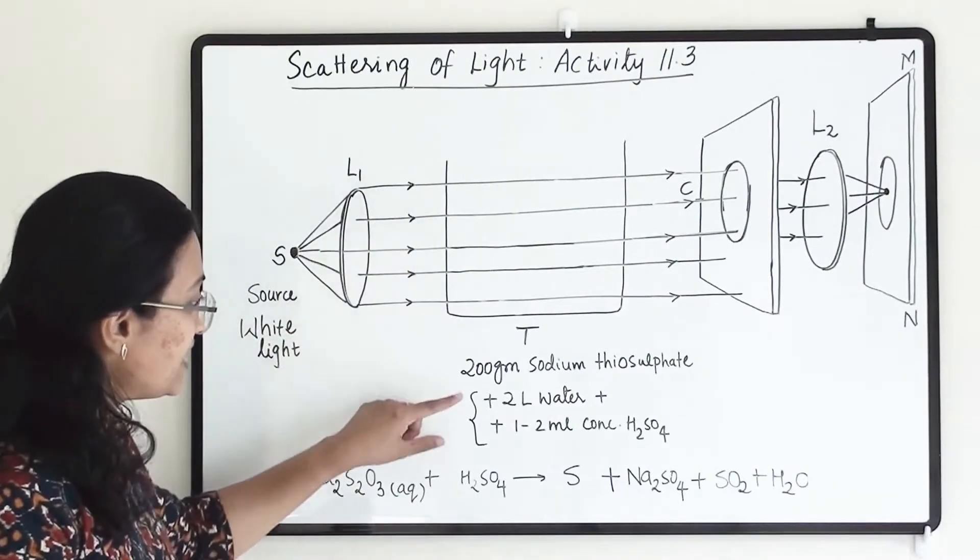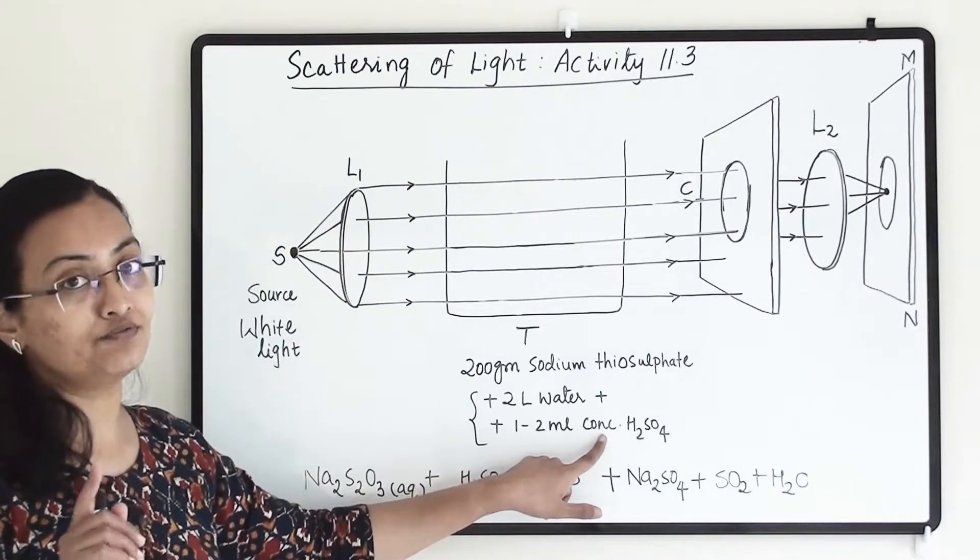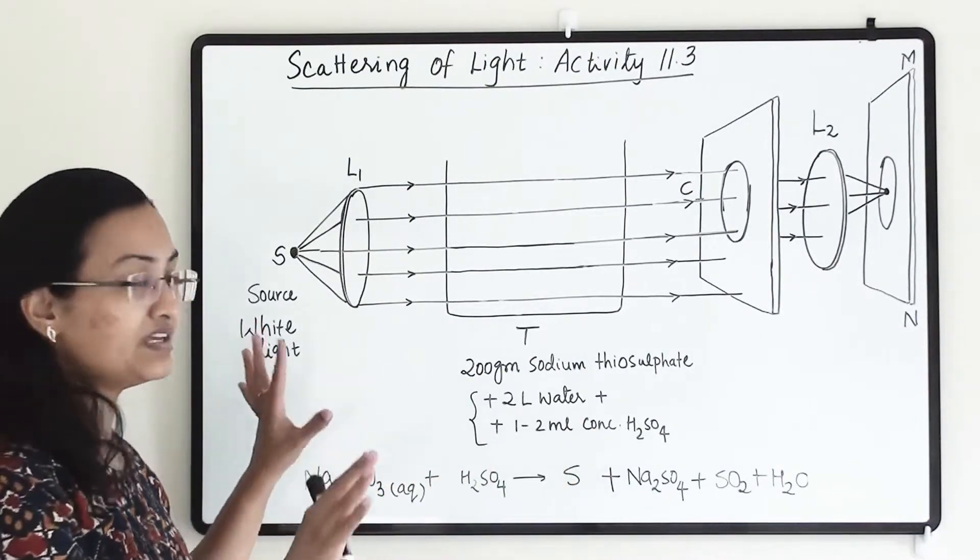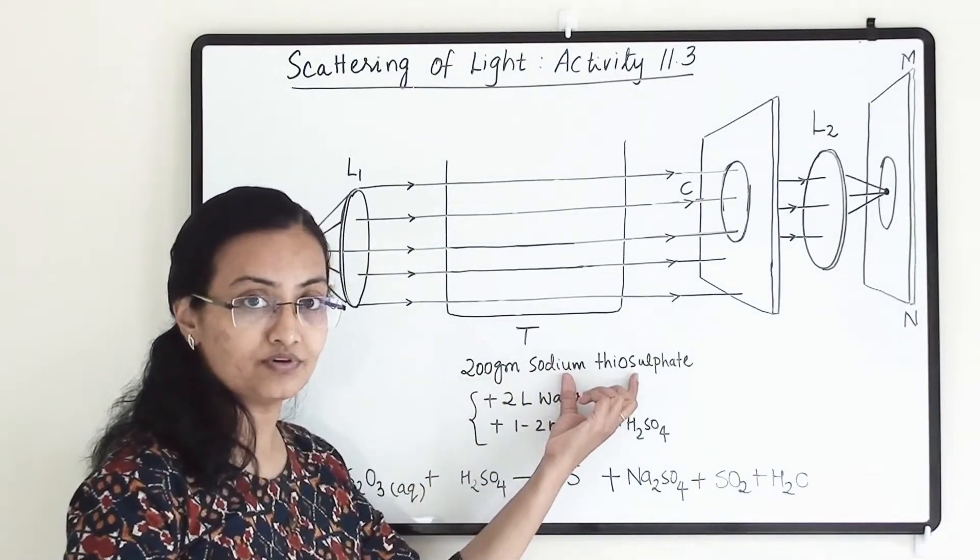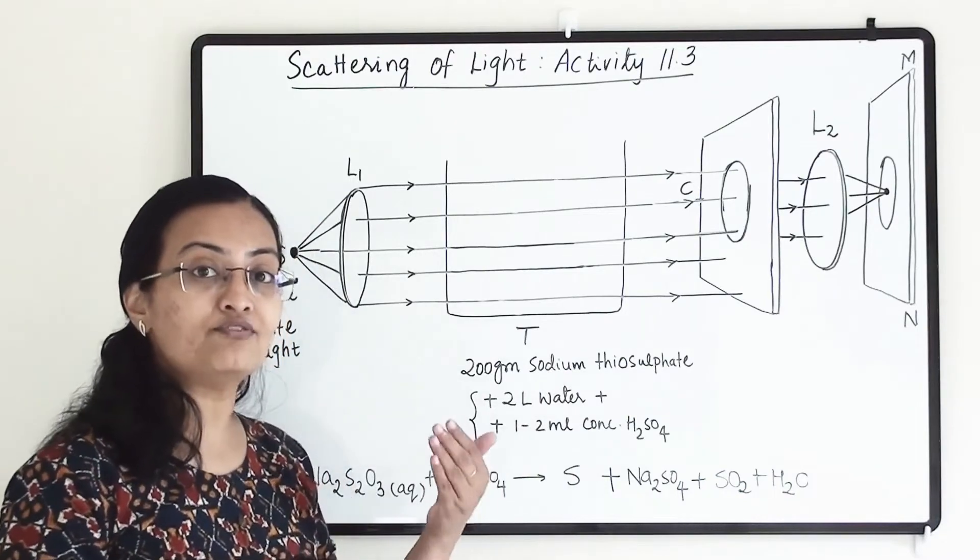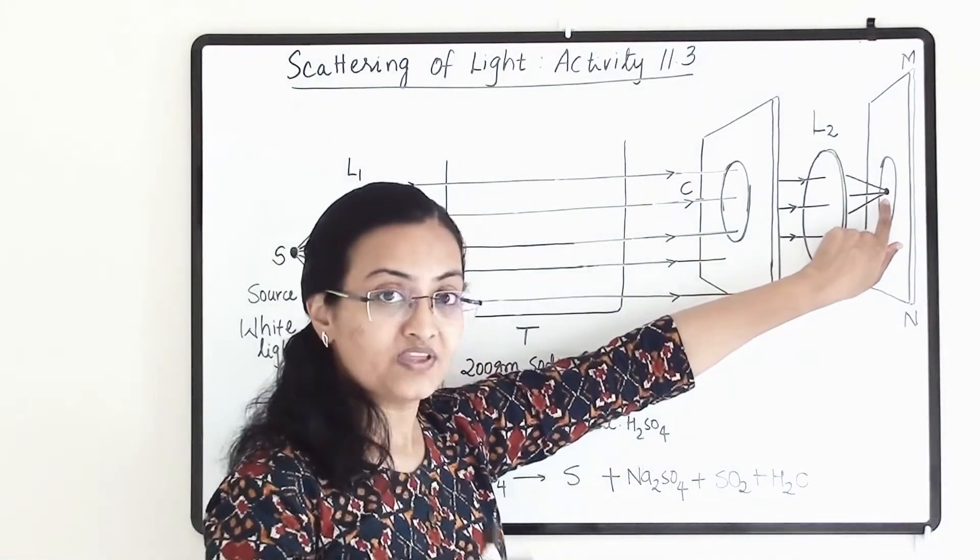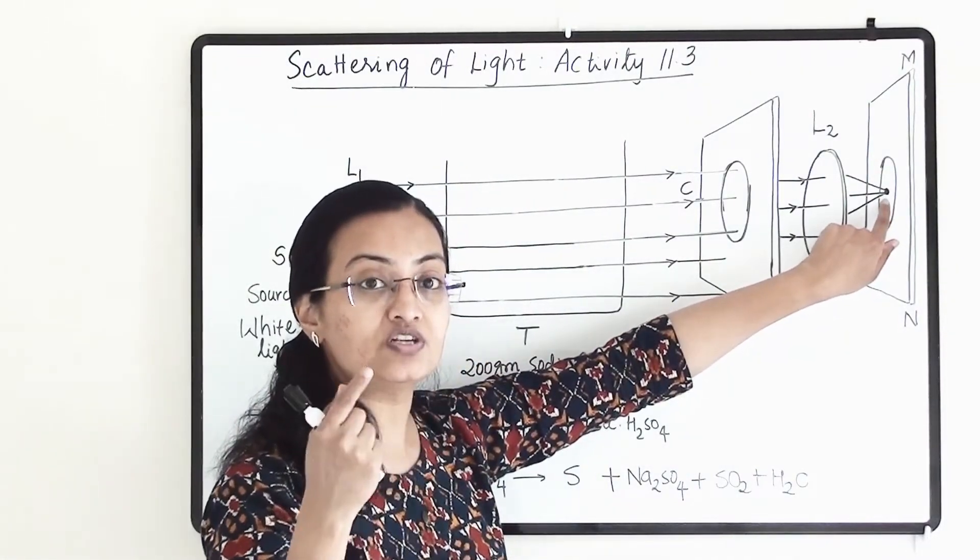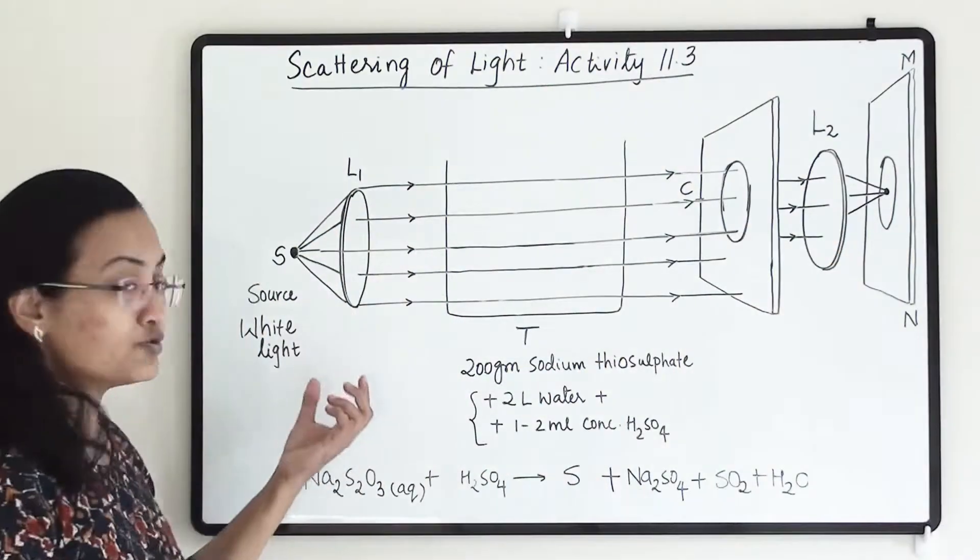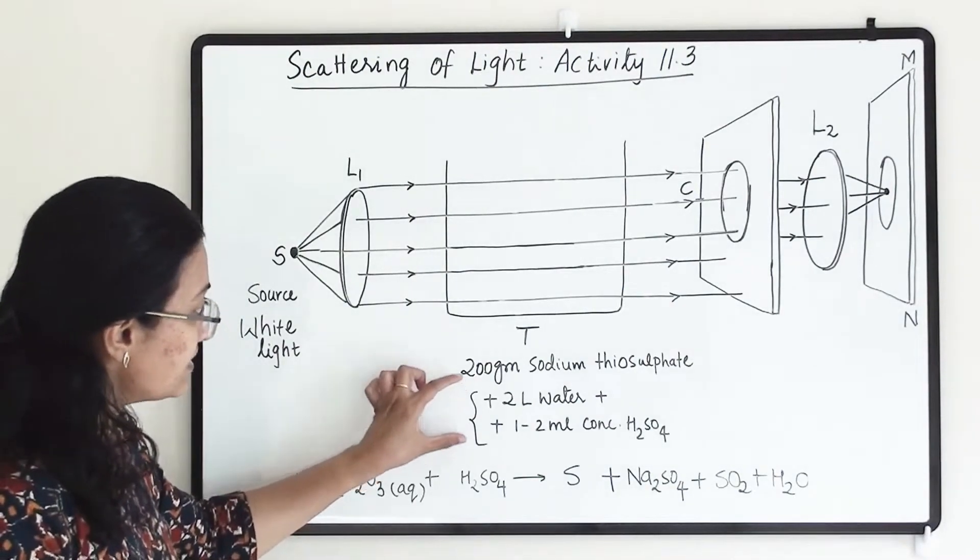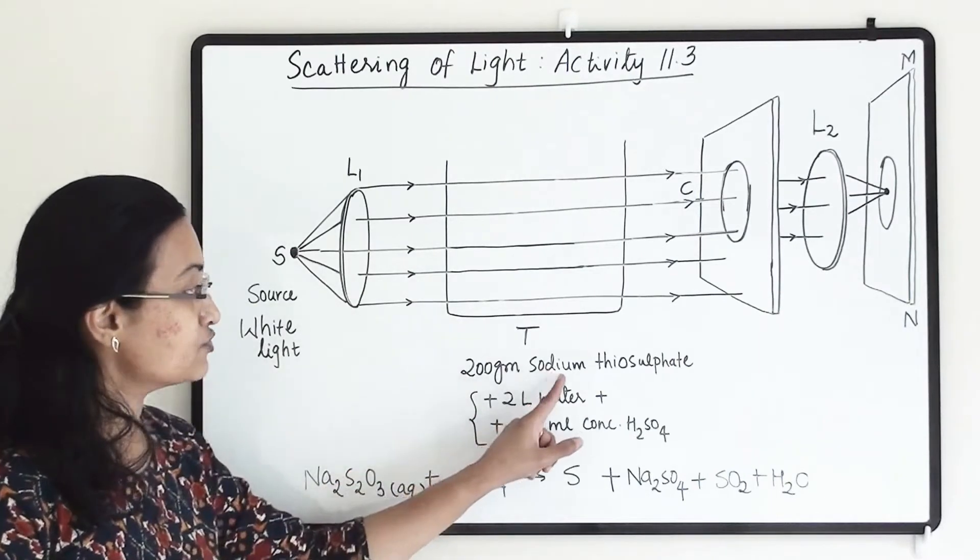So in this tank we have taken two liters of water and we have added one to two ml of concentrated sulfuric acid. Once everything is ready we are going to add sodium thiosulfate, that is 200 grams of sodium thiosulfate. Once we will add this, after one to two minutes our reaction will start and we will be able to see that here the white color beam will change and it will continuously change its color. So let us understand how and why. So in this activity these two things we are taking into the tank and once this setup is ready we are going to add sodium thiosulfate.